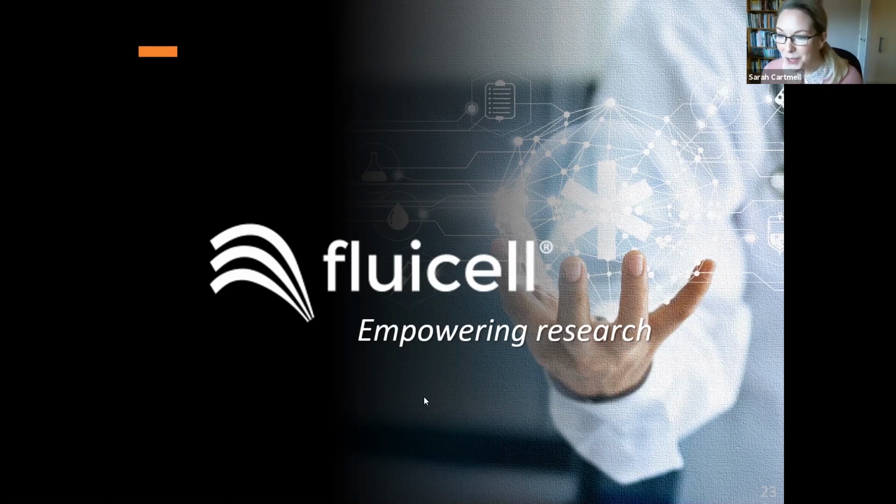The next question I have here is from Monoha, who asks if the 3D printed tissues need to culture for a certain amount of days to develop their own innate extracellular matrix, in consideration of drug screening. Yeah.